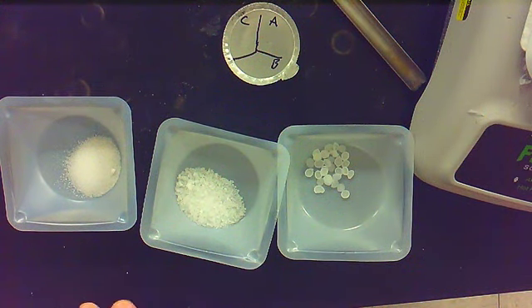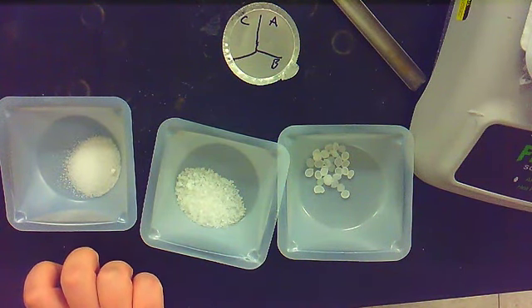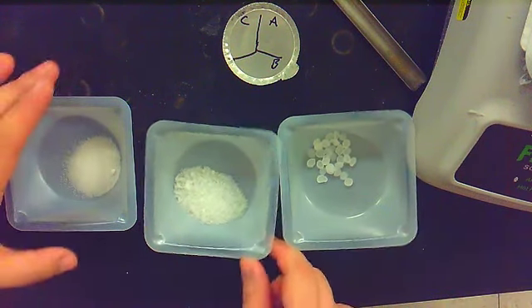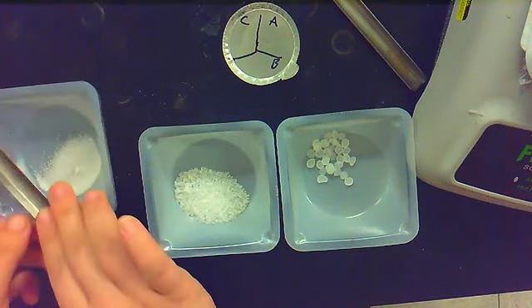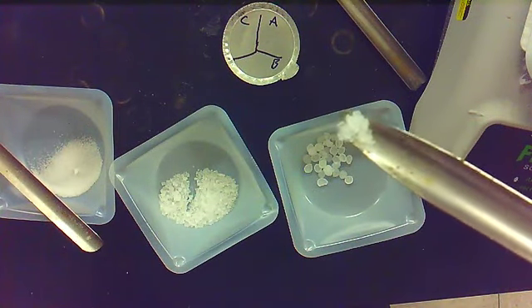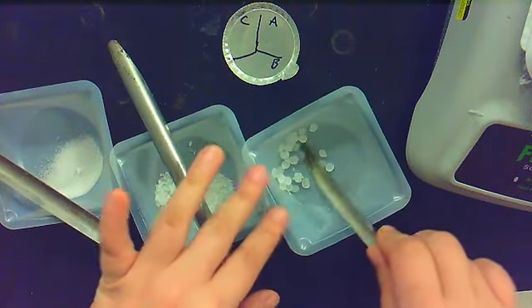Hello, today we're going to do the identifying the types of compound performance task. Just like we did yesterday in the lab, I've got three different chemicals, right? This one is granular. Okay. This one is bigger, right? And then this one looks like little pebbles. Okay.